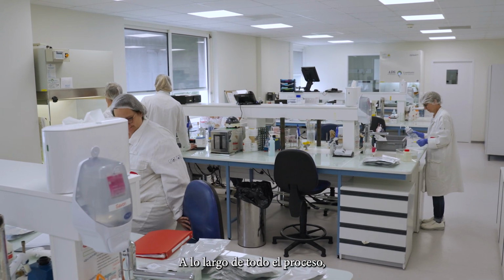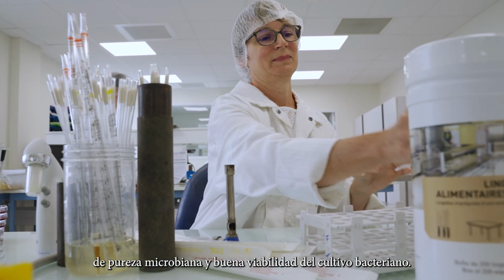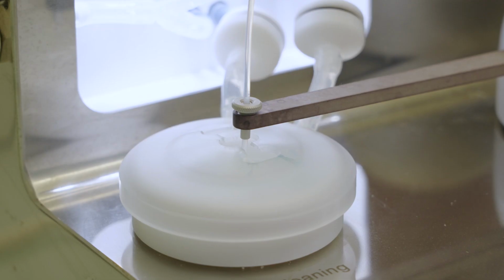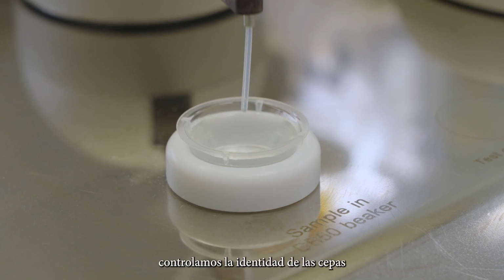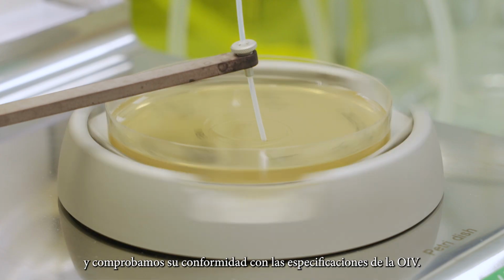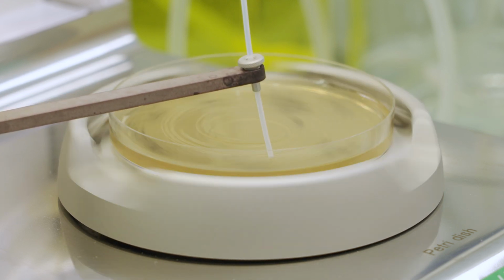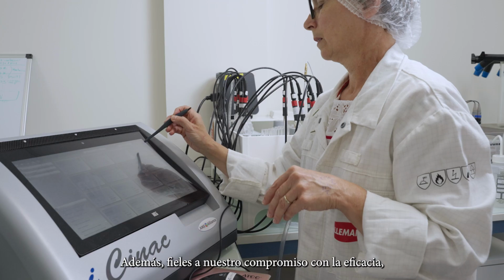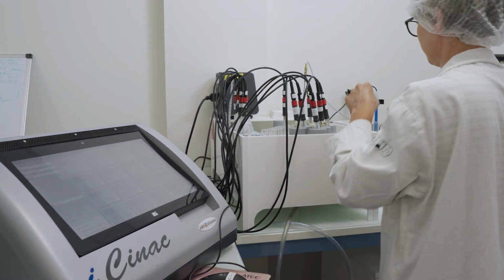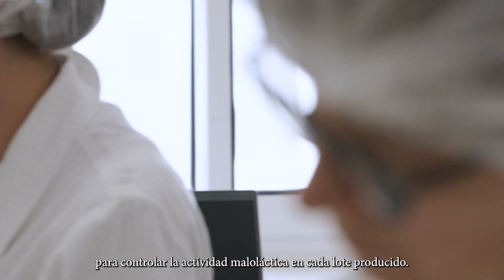Throughout the entire process, the quality control team performs many analyses for microbial purity and good viability of the bacteria culture. Before their release on the markets, we control the identity of the strains, and we check their compliance with OIV specifications. In addition, from our commitment to efficacy, we have developed specific internal quality tests to control malolactic activity in every batch produced.